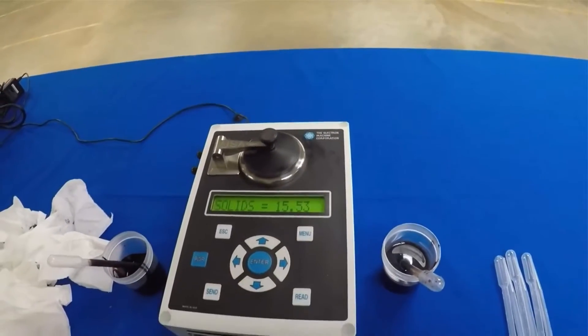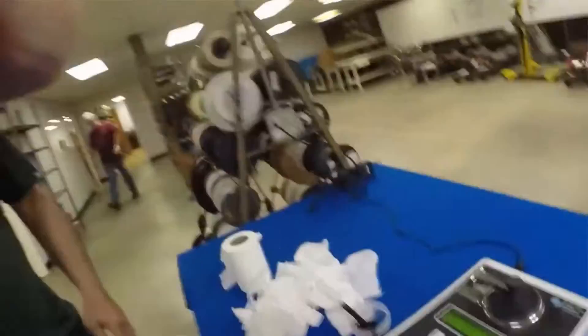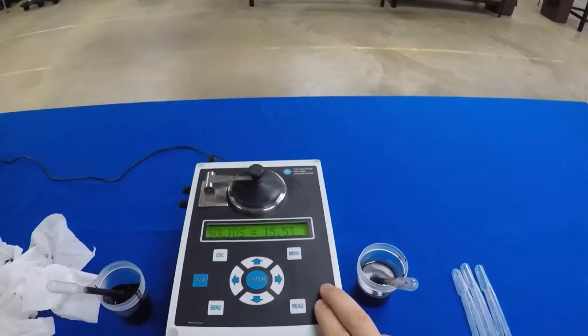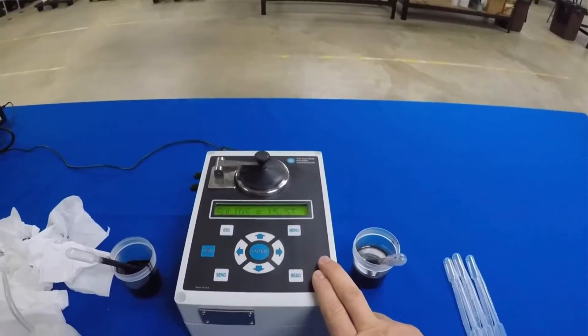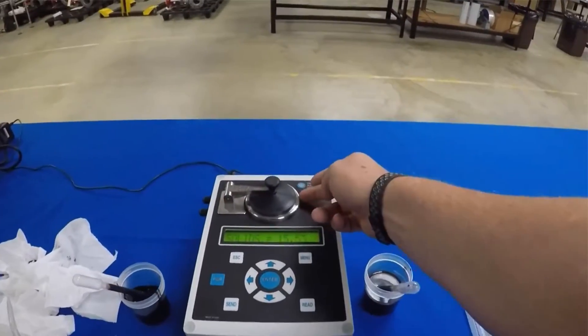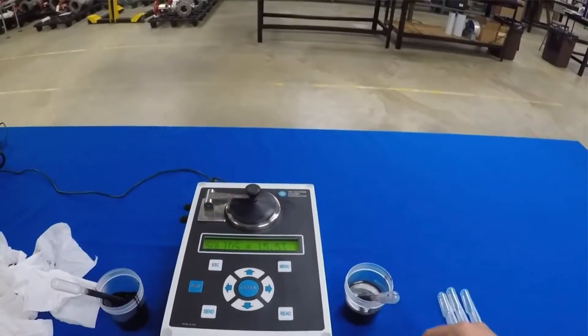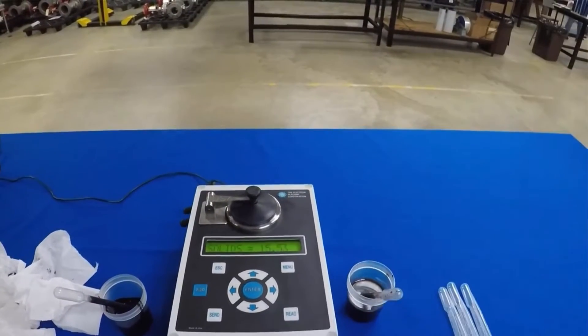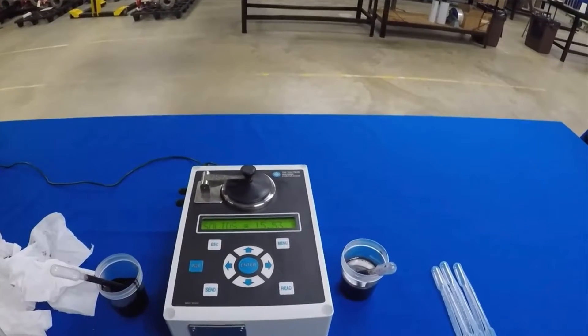We'll switch back to the weak liquor just to show you it will be repeatable as well. And we're back at the same 15 sample that we had before. The DSA is a great little tool to have in your toolbox — it provides accurate and repeatable readings, it doesn't matter who's using it, the unit doesn't lose its calibration as long as someone doesn't throw it down the staircase. The sample chamber is heated so you can put black liquor samples directly from your recovery boiler or evaporators on there, clean it off, and it'll be ready for the next time.